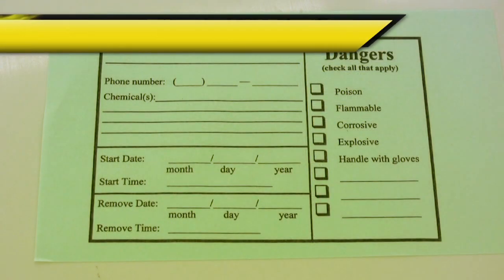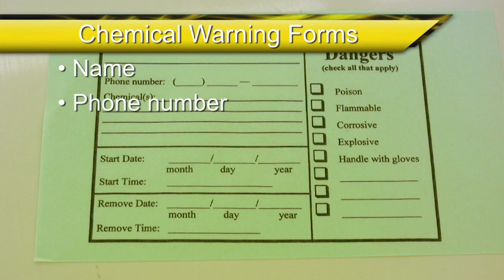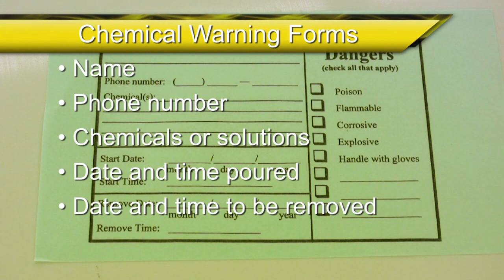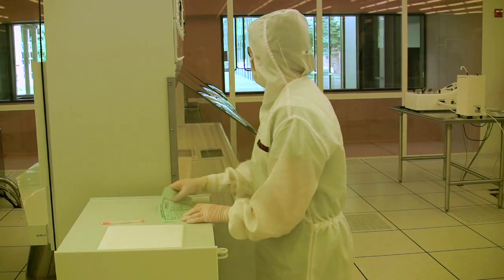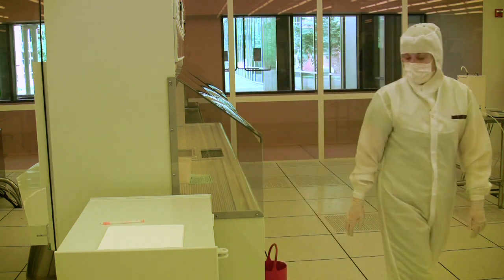Once you have acquired a chemical warning form, you will need to write the following on it: your name, a phone number you can be reached at, the chemical or solution in use, the date and time it is poured, the date and time you intend to remove it, and all the dangers that apply. With the chemical warning form properly filled out, you can now begin gathering the labware you need from the storage cabinet.